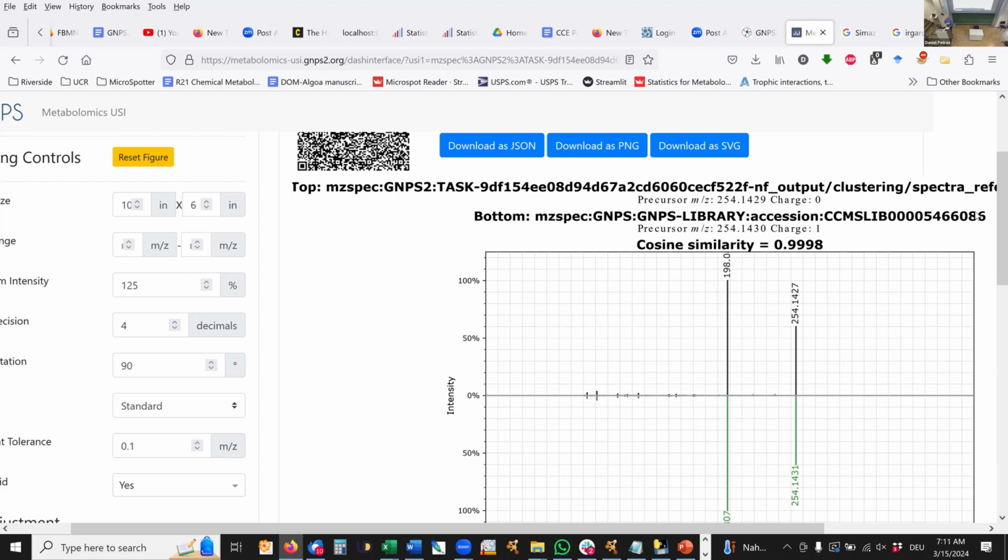Or to even verify it in a biological context, right? I said already, well, I think that this might be a biodegradation product, right? I could do an incubation experiment, right? And maybe just incubate it in seawater to see if some of the microbes present in there actually make this compound, right? And I think these types of downstream verifications are super, super important. So all we do here is we prioritize features and we point to something that we think might be important. But I think at the end, this is hypothesis generating, right? And you need to do downstream hypothesis testing.